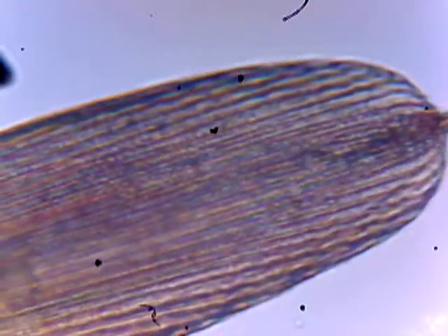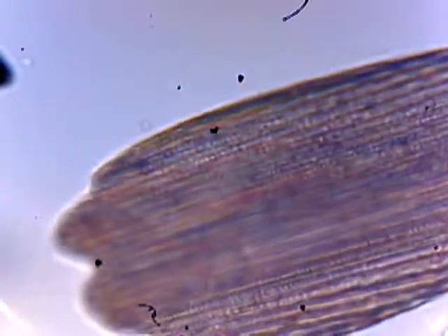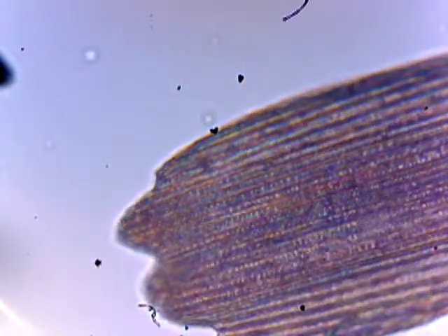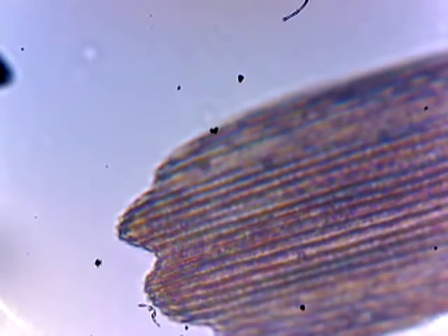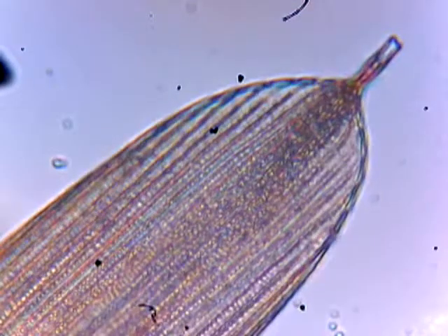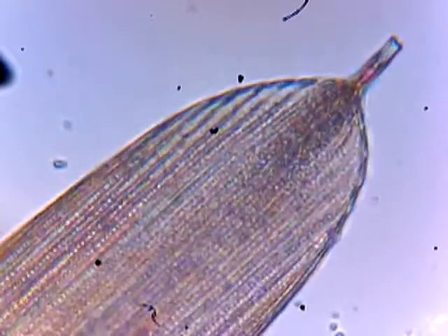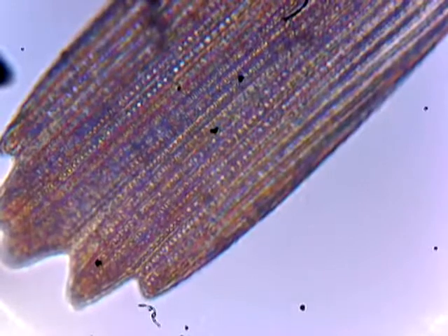I may have to break this up into two videos, because I think I'm going to run out of time. I've already killed ten minutes on this alone. Look how beautiful that is. It's amazing, isn't it? The world under the microscope is just so fascinating. There are levels of detail — without the microscope, you would never know any of this is here.